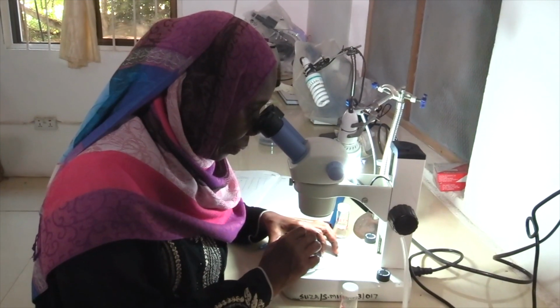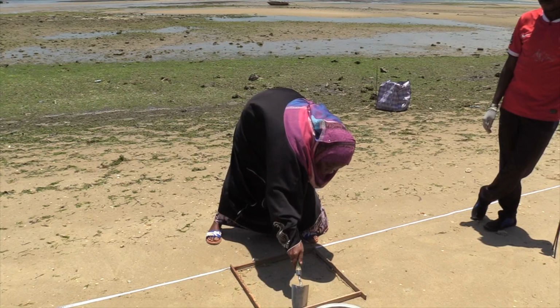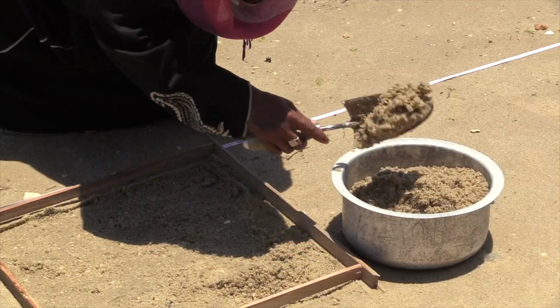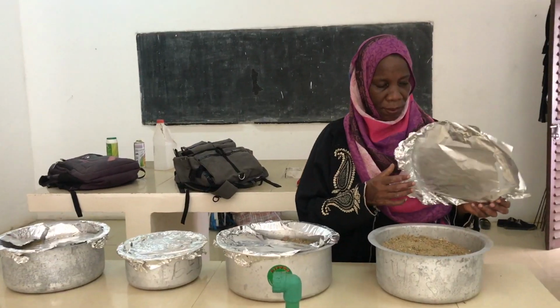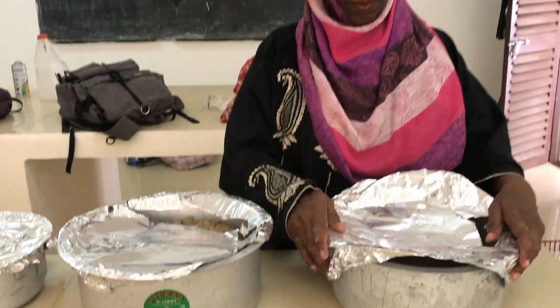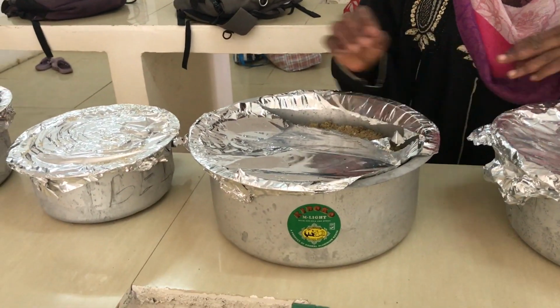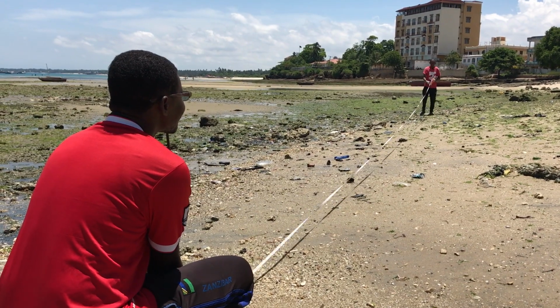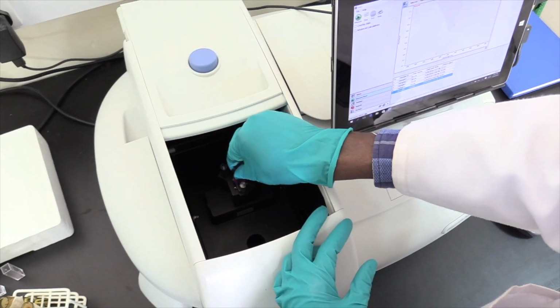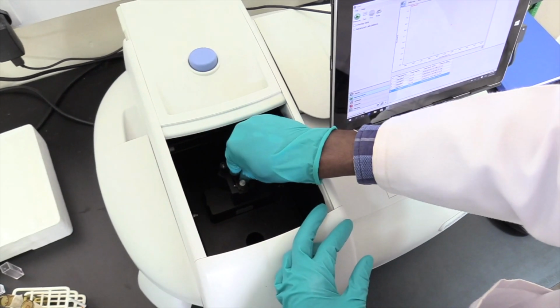In this video, you'll learn how to perform primary data collection. That is, how you collect the relevant microplastic samples for your study. Systematic collection of primary data is a key part of field-based research. You should always use standard data collection methods. In this way, other researchers will be able to validate your research.